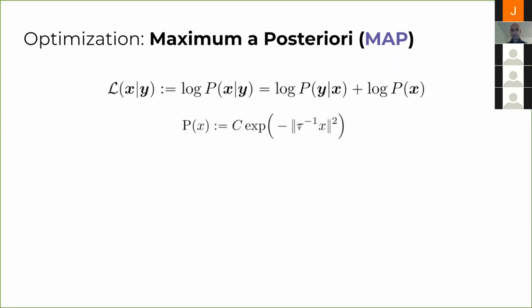So what happens is that, because it's tau to the power of -1, when tau is large, you lower the effect of the prior, and when tau is small, you increase the effect of this prior. And I'm going to come back to this expression here. It might not be completely clear what this means, but I'm going to come back to it real soon.